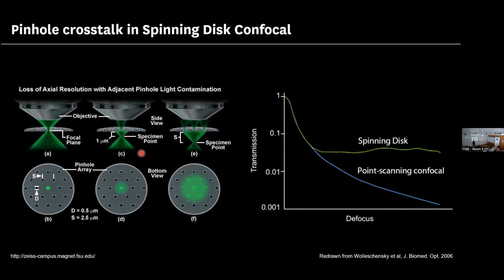So imagine working with bacteria in the form of biofilms. Well, at some maturation stages, they move a lot. So I would hope that in spinning disk confocal, that movement of the bacteria would not be so much detected as it is in the point scanning. So this problem you're talking about is more attributed to fixed samples? No. This is depending on the thickness of the sample.